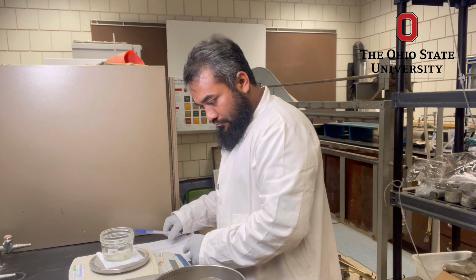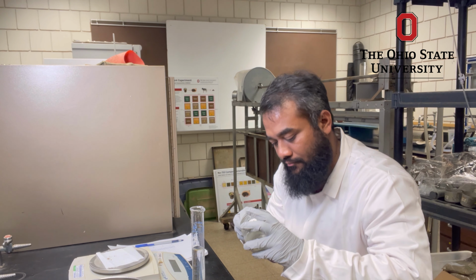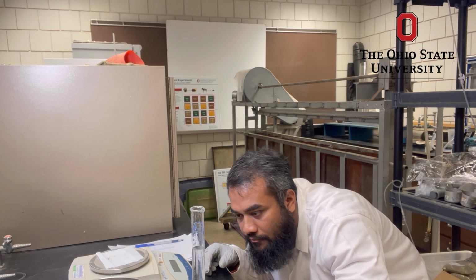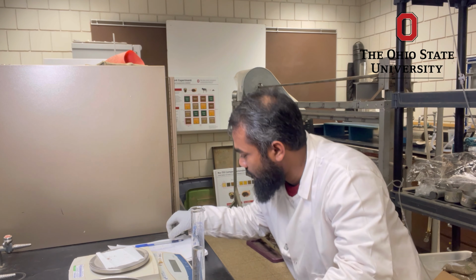Step 7. Coarse fragment volume correction. We use a measuring cylinder for doing that. The volume occupied by the coarse fragments is calculated using an assumed particle density, typically 2.65 grams per cubic centimeter.